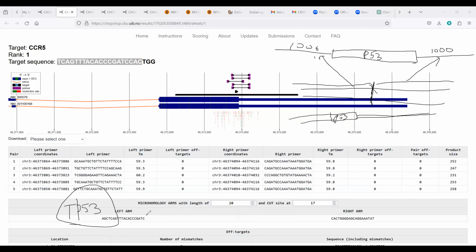But what if it is perturbed? Though you are using bioinformatic tools to minimize those off targets, sometimes it can happen, right? So you need to always sequence the entire genome and see whether any unwanted cleavage elsewhere has happened. Okay, and if it's not so, then it's good. The treatment is successful.